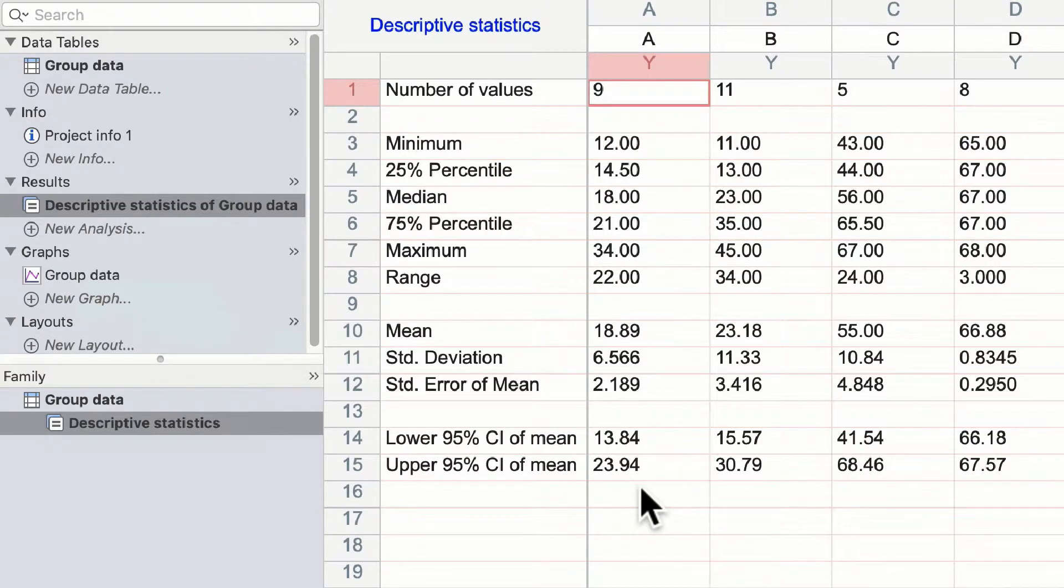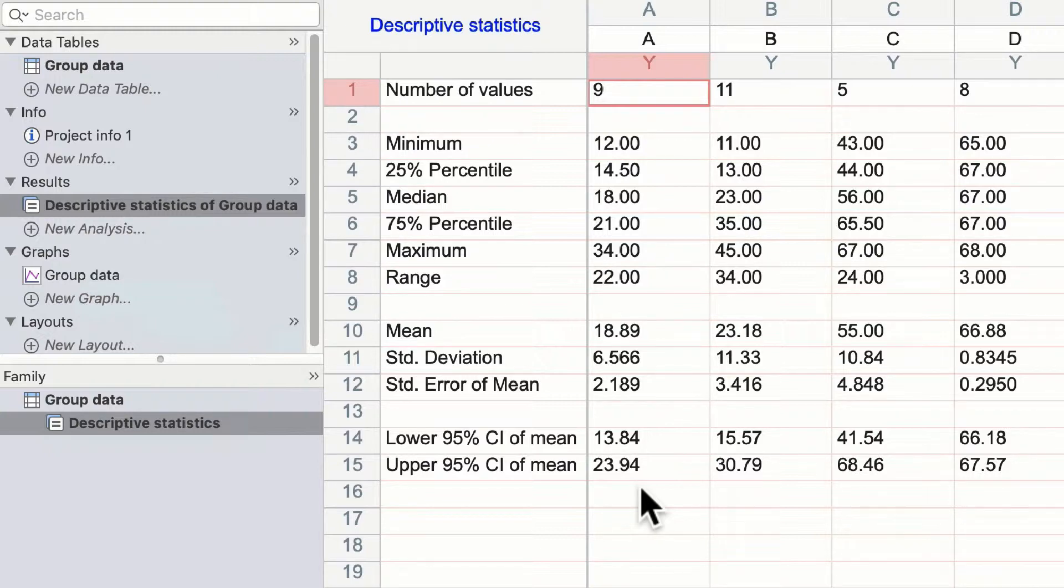You can see our n number in the top row and then our minimum, percentiles, median, maximum, range, etc., down each column.